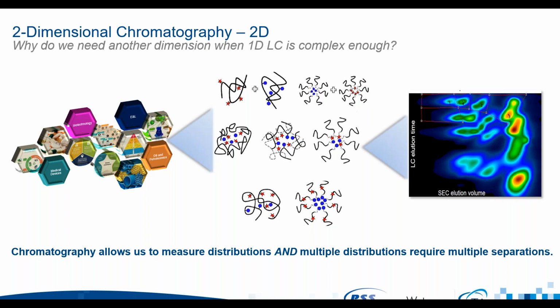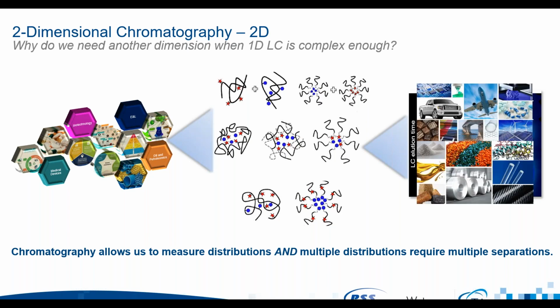Standard GPC or LC alone doesn't always give you enough information about the polymer structure and, more importantly, its predicted properties on a bulk scale. So to answer the swathe of questions that tend to go along with producing these types of products, which you can see here, while ensuring things like safety and reproducibility are maintained, a wider range of analytical techniques are often needed.